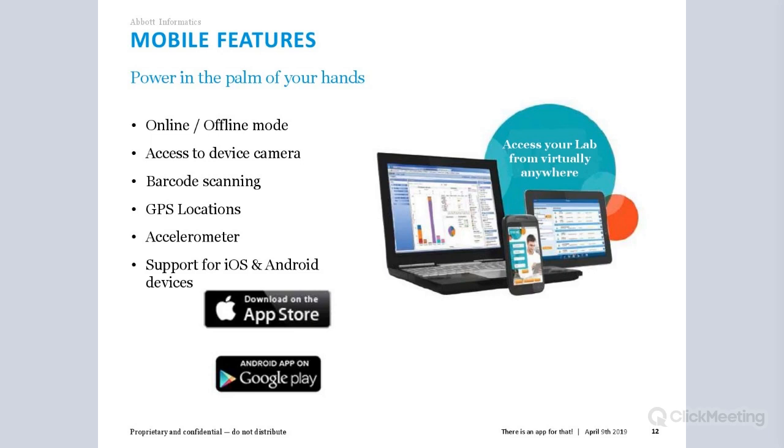So the basic operation mode of these STARLIMS mobile apps is: number one, you download the necessary data from STARLIMS whilst online. Number two, you perform the site activities and manipulate the data whilst offline. And then finally, number three, you upload data back to STARLIMS when an online connection is available.